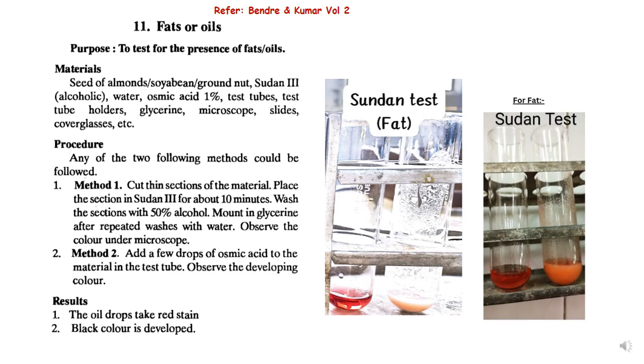Here you see the Sudan test for fats. You see that it has turned red in color, and we say that the test solution has fat present in it.